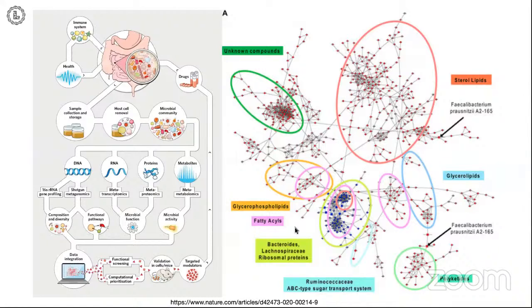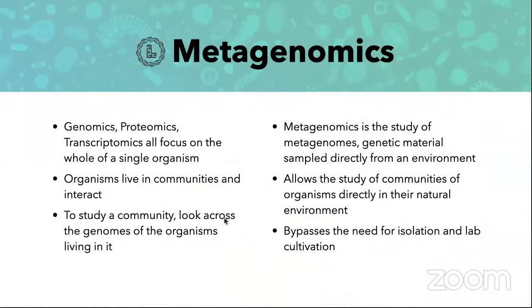I see that the majority of you are not so familiar with metagenomic sequencing. So let's define what metagenomic sequencing is and what kind of information it provides us with. Metagenomics refers to both a research technique and a research field. Metagenomics can be defined as the genomic analysis of microbial DNA from environmental communities. Metagenomics tools enable the population analysis of unculturable or previously unknown microbes.